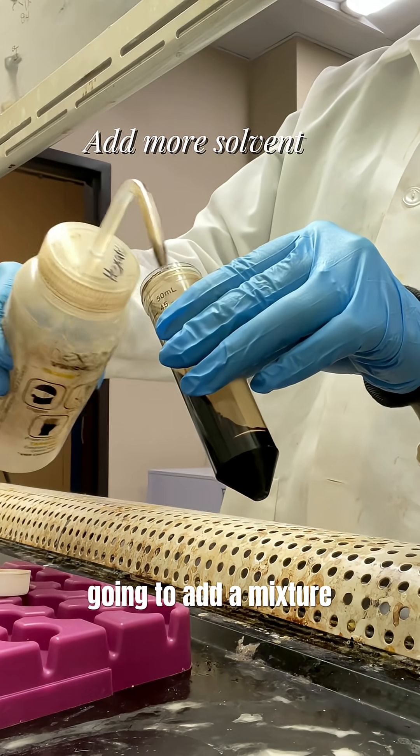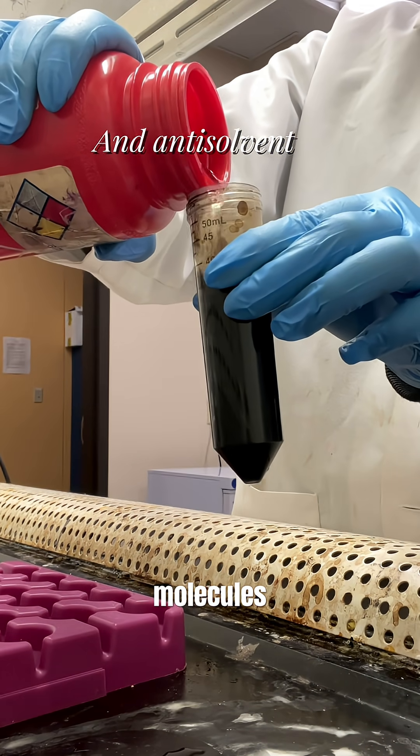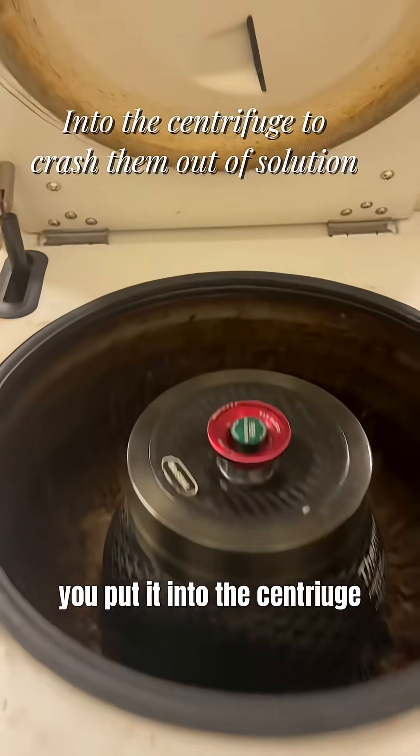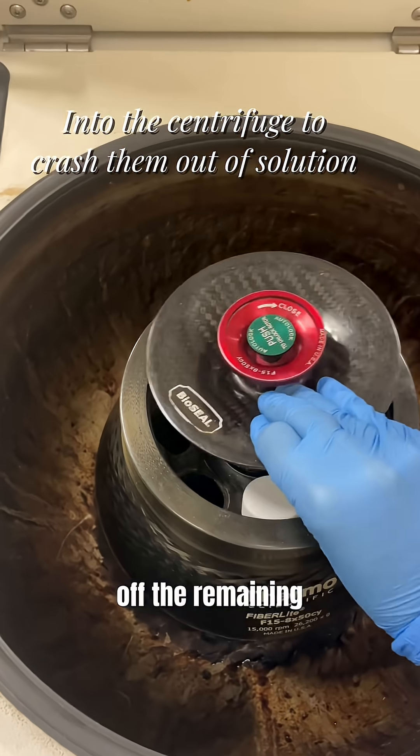This is how we actually clean them. We're going to add a mixture of solvent and anti-solvent. This is going to strip away the molecules that we don't want in there anymore. Then you put it into the centrifuge. This is what's going to crash the particles out and then you can pour off the remaining liquid that you don't want.